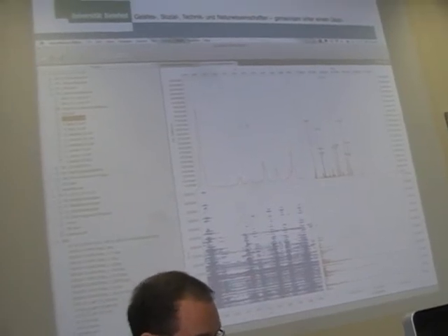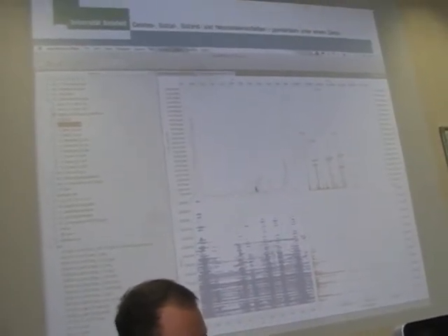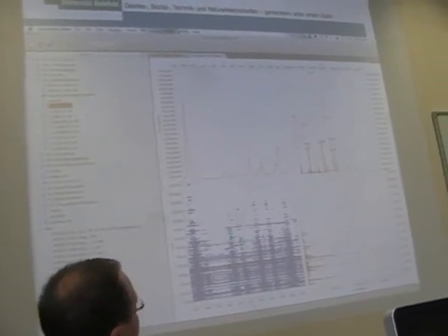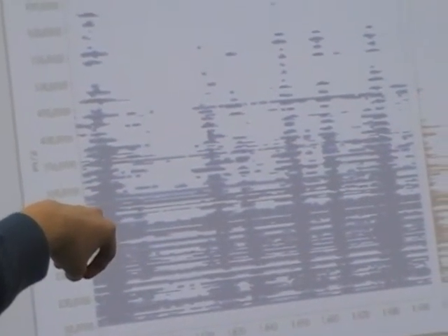As I said, and give you some impressions on the different components. So this here is the chromatogram view for one-dimensional and two-dimensional chromatograms. On the bottom down here is a heat map view, and these are all charts which are created by JFreeChart, and they are all linked to each other. So if you click on this one, then it is selected down here. This is not done via lookup or anything, but with onboard methods of JFreeChart.